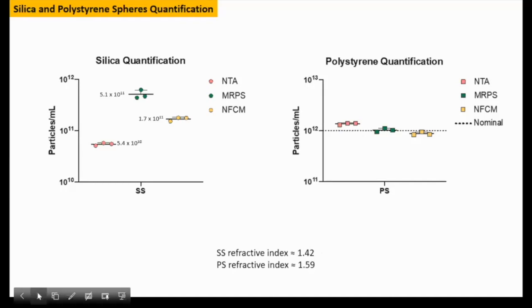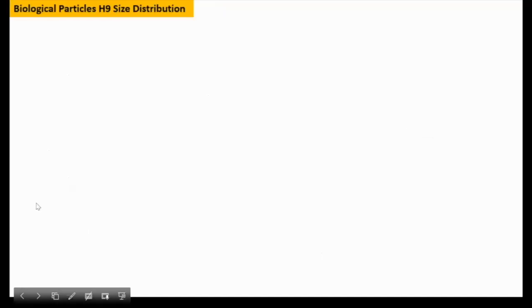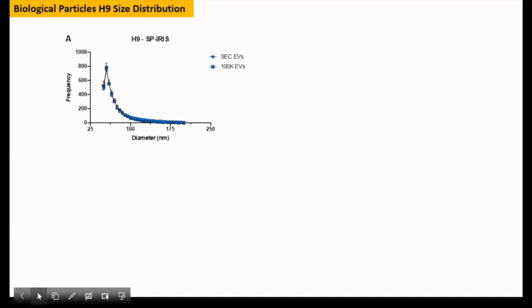Thank you so much, Emily, for presenting our data on the artificial spheres. I'm going to take care of the second part, which is the biological samples. So EV preparation from H9 and U937, as already mentioned, were measured for all these platforms.